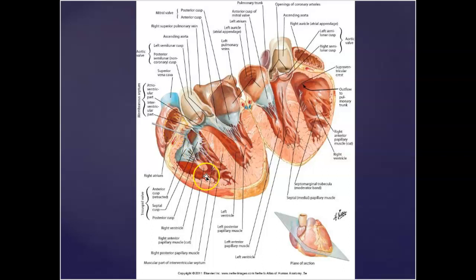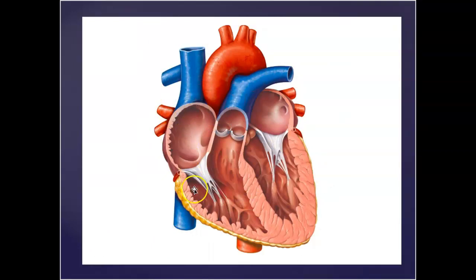So the papillary muscles are going to rise from the trabeculae carneae, and then they will contract as the ventricle contracts, and then push the blood out the pulmonary trunk. Now, it's not so easy to see this here. Probably easier to see this shot here. So the right atrium, this is probably a better picture for this anyway. So you can see the papillary muscles here, chordae tendineae attaching to that tricuspid valve. There's 3 flaps here. Actually, three of the valves have 3 cusps. Only one of them has 2. We'll talk about that on the left side.